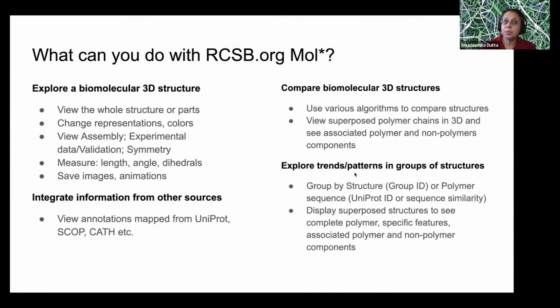We will show you options for comparing structures and then visualizing that in 3D using the MolStar tool. And finally, this option is to look at groups of structures and to look at patterns, trends, and things like that. And this will also come in handy in one of our examples.